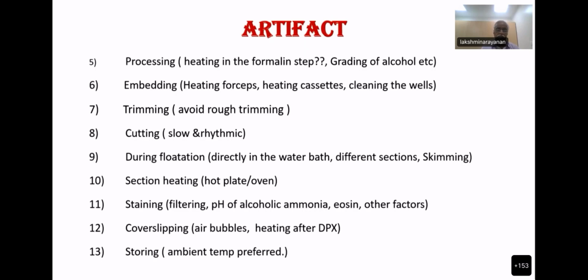Many factors are there. Then cover slipping, generally the air bubbles are introduced. That is why people go for automated cover slipping machine or the tapes. But the air bubbles, when you scan it, nowadays in the digital world, the slides are being digitalized, so the air bubbles will give a lot of negative.